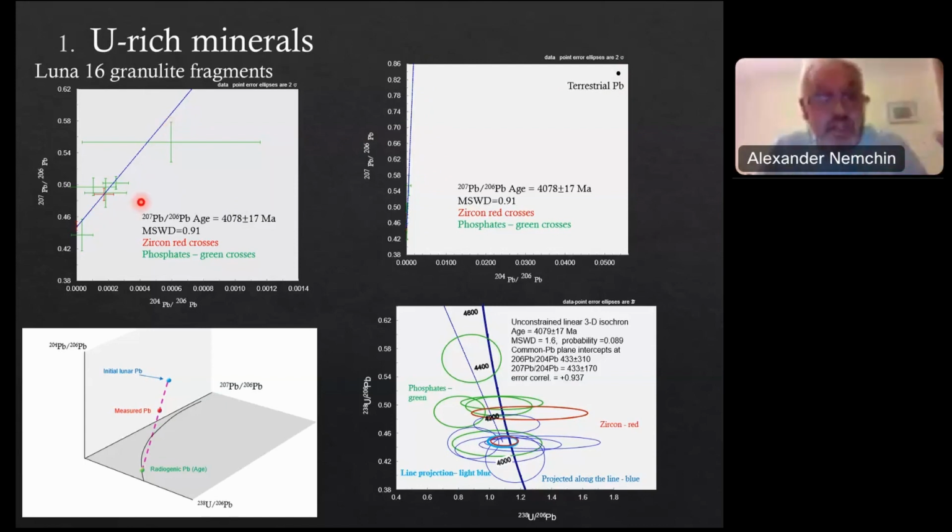And then we can try to constrain the line in 3D utilizing uranium-lead systematics. So the idea here is that, okay, at the bottom, the darker gray is our Concordia plane. And our measured lead for each of our points is hanging somewhere. This left side, lighter gray, is what is called the common lead part. So it's 204, 206, 207, pretty much this bit here.